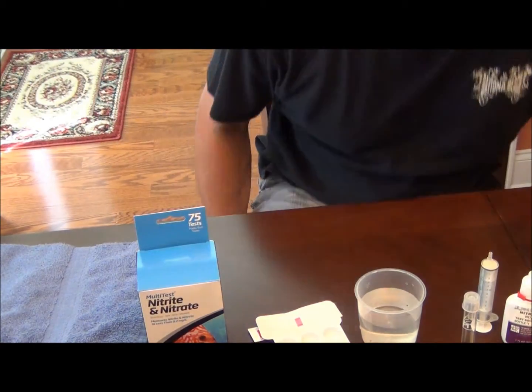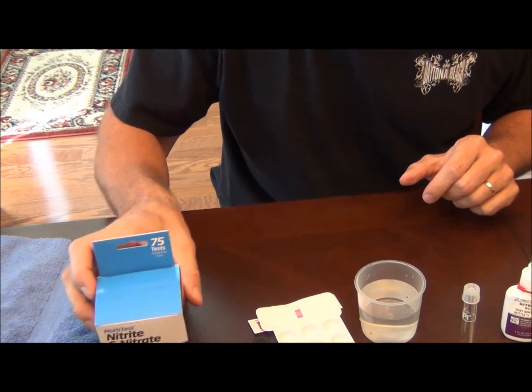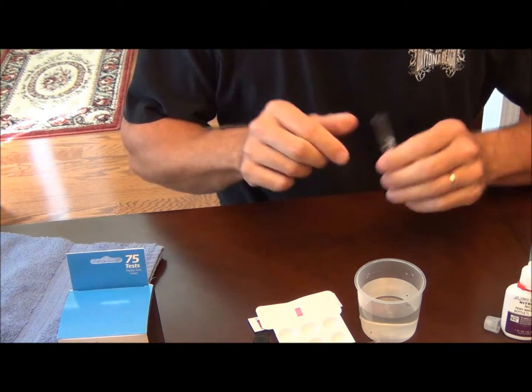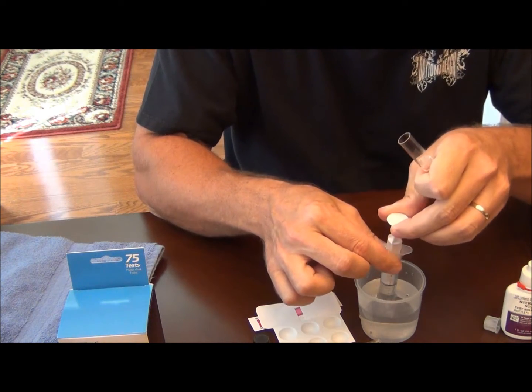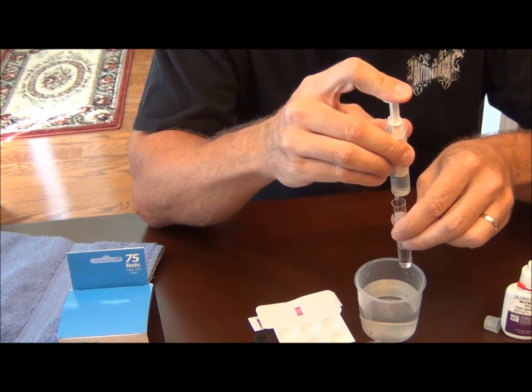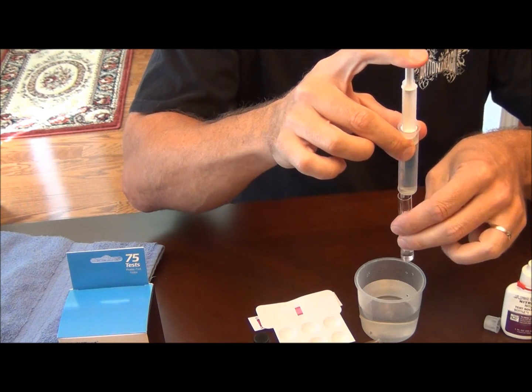This video is going to lead into a couple more videos where I talk about different methods for removing nitrates from your aquarium. Let's go ahead and get this test started. This is the API 5mm test tube. I'm going to go ahead and rinse it out a couple times with the test water, then fill it to the line.